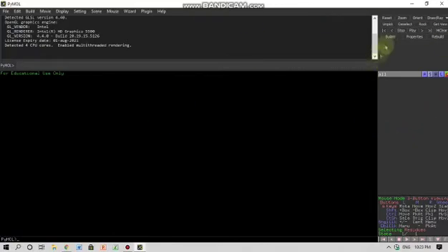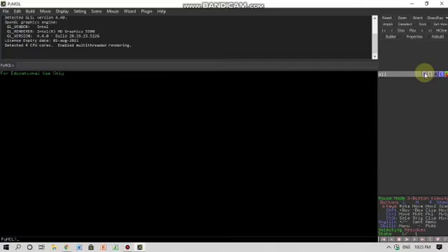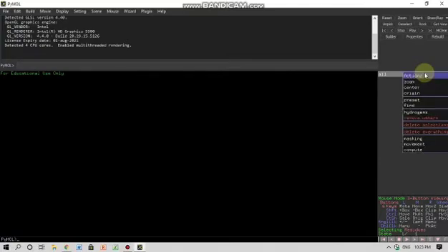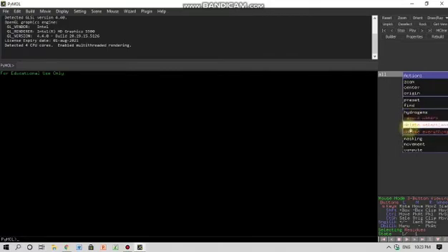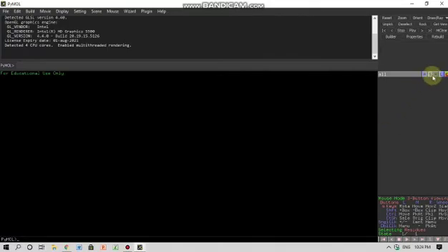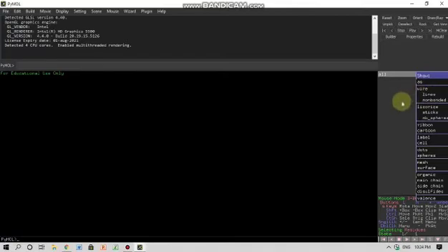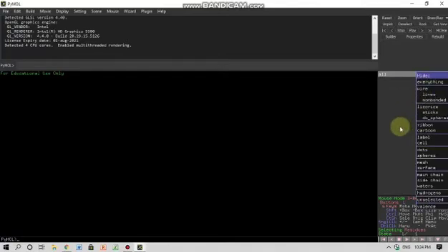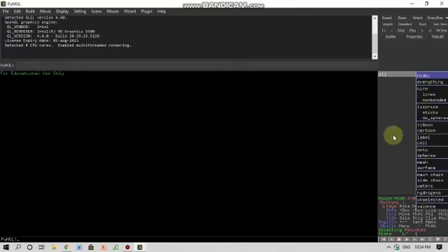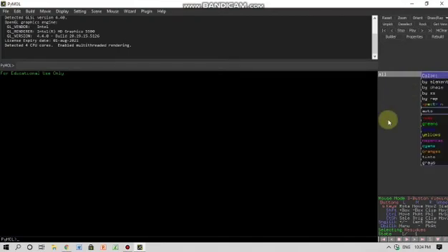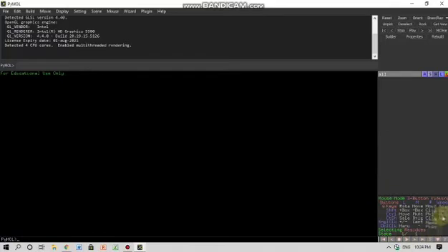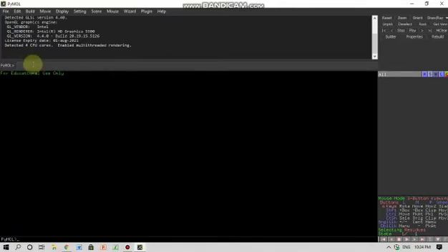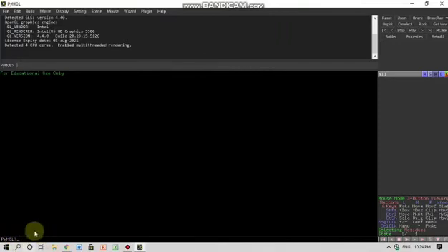This is the object menu panel. You can do whatever you want with the protein here by clicking on the action button, and you can remove waters and do other kinds of things. You can also change the shape of the protein, hide particular areas, label it, and color it. Below that, this area is the mouse control area and this is the movie control area. This area where PyMOL is written is the command line, and this bottom area is the command line input.